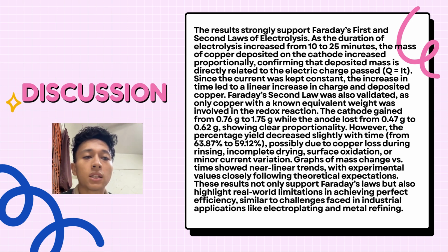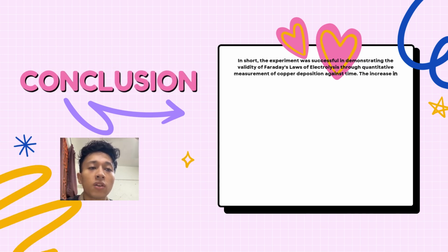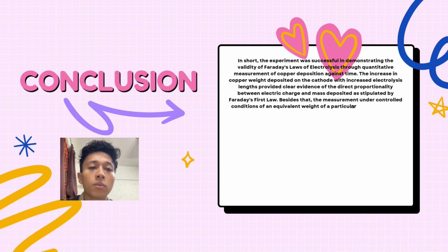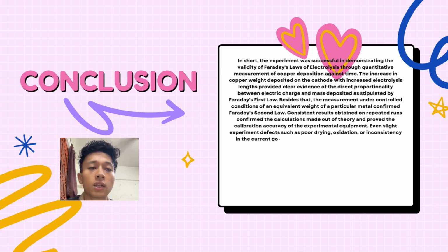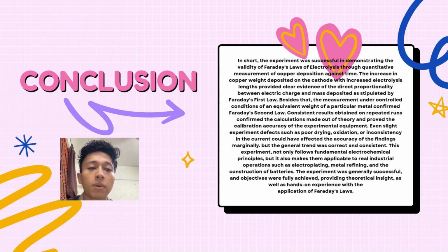However, our percentage yield slightly decreased from 63.87% to 59.12%. In conclusion, the experiment successfully validated both of Faraday's laws while also highlighting common experimental limitations. These findings reflect not just theoretical accuracy, but also practical challenges in real-world electrochemical applications such as electroplating, metal purification, and battery technology.